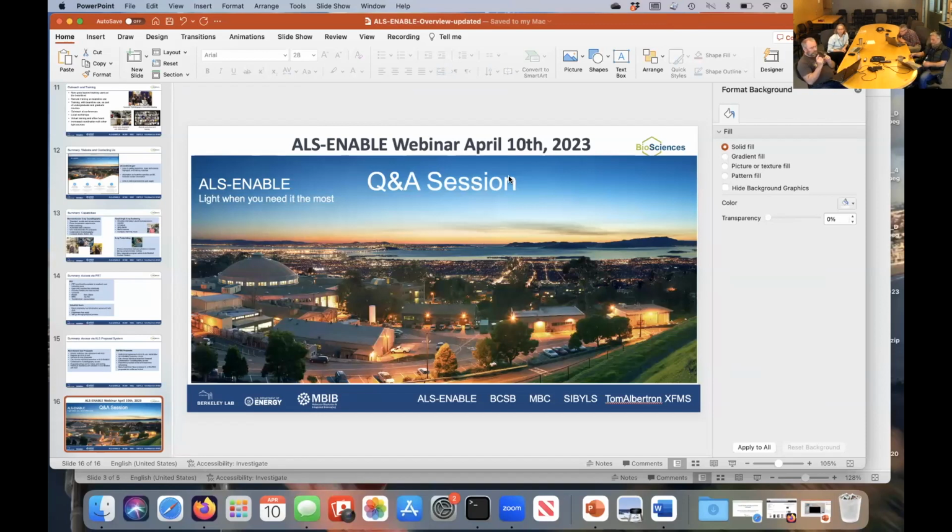You can, well, the long and the short of it is you can tell if the metal is in the beam. Yes. So if there's metal under the beam, it will light up in fluorescence. The way to tell if it's found in the crystal is a different experiment. You want to collect diffraction data. To do the metal scanning, the crystal can be dead. It doesn't have to diffract at all. You want to collect diffraction data above and below the edge of interest, and then it will either light up with an anomalous signal in one and not with the other. There's nothing else in the periodic table that will do that. So it's actually one of the best ways to definitively identify a metal in a sample.